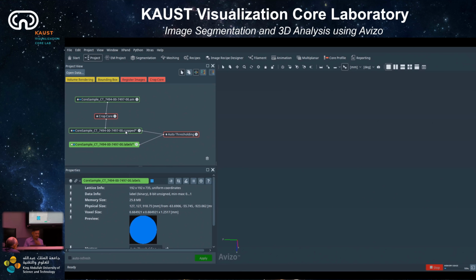And you can see that now, from the thumbnail, we create just the mask. Yeah, we keep the label.